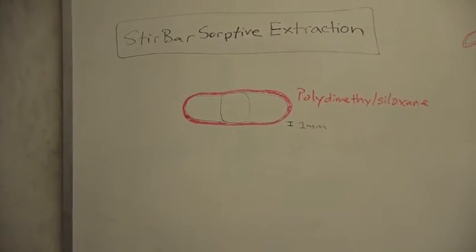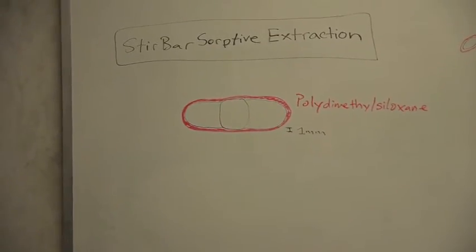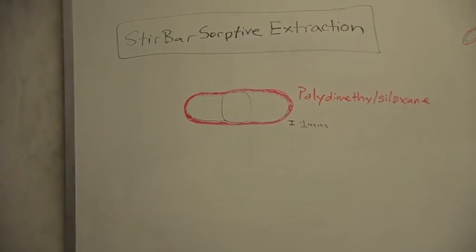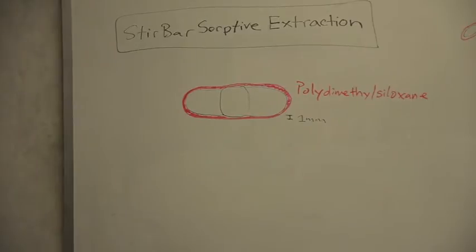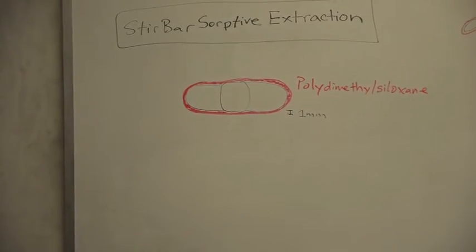Over the past few years, there have been many methods developed to improve MS. One method developed recently is known as stir-bar sorptive extraction, which is mainly used to analyze contaminants in environmental water systems. The main use of this method is to concentrate pollutants in water samples, since the pollutants are usually in concentrations that cannot be detected by the MS.